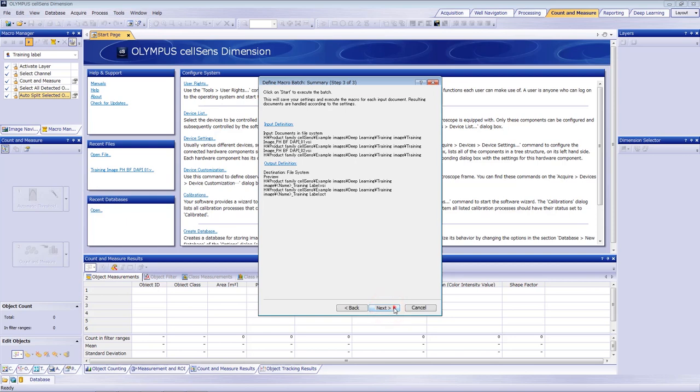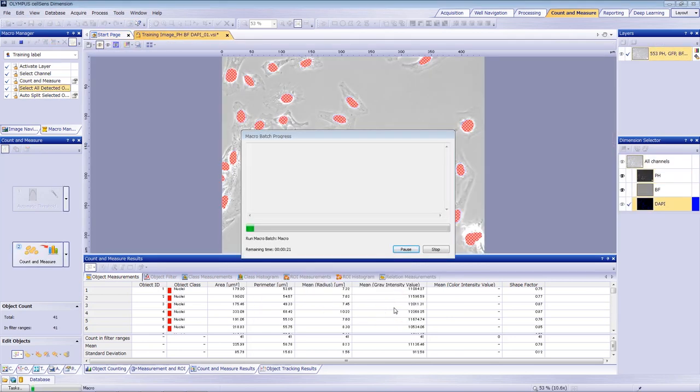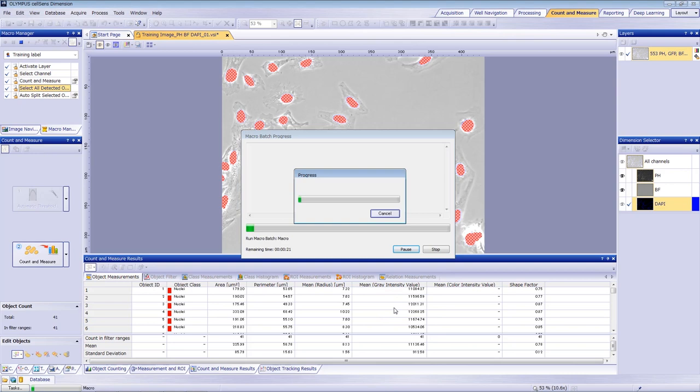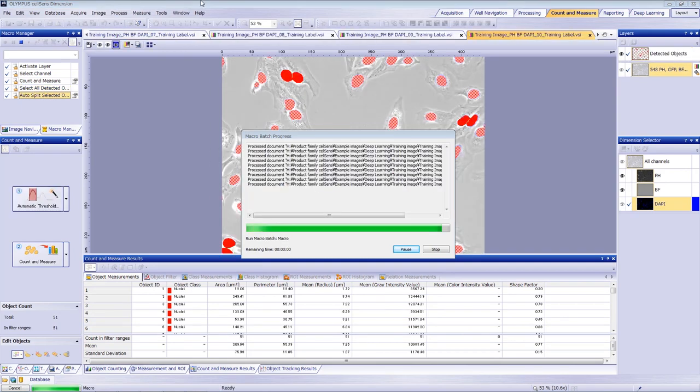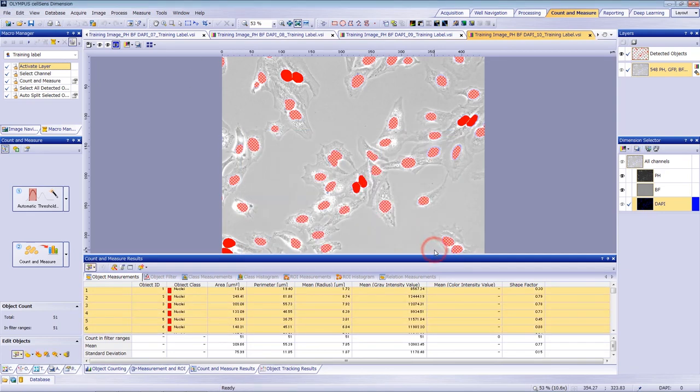Run the batch macro to create training labels for the 10 images. Check to confirm that the process was successful for all 10 images and that the data was saved in .vsi format.